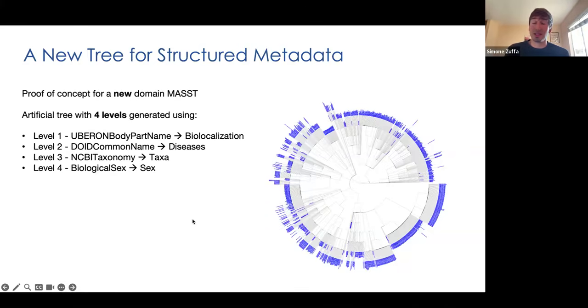The concept itself is basically that if you are doing your microbiome metabolomic study, let's say, and you find your biomarker of interest, you can search the MS/MS spectrum. Let's say that this biomarker was found to be associated with Alzheimer's disease.